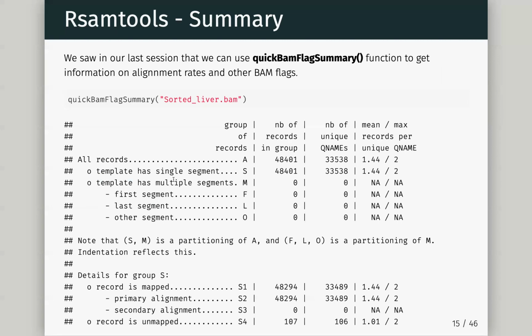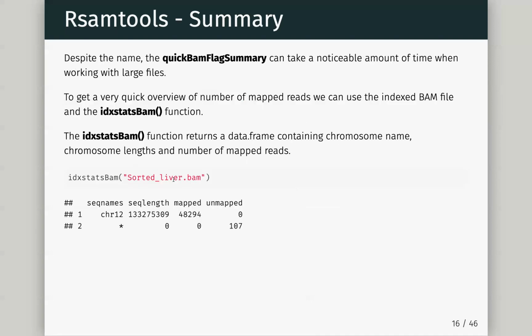And it's going to evaluate them, read the flags, and then give you the result. Okay, we get useful information, but most of the information I really want to get from this is how many reads I actually have in my file. How many were mapped.